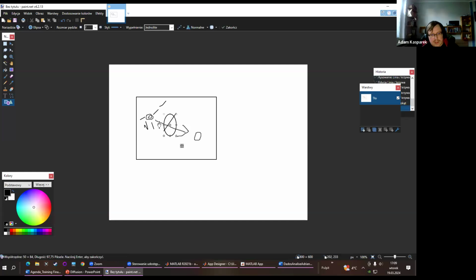There is some mountain which it has to go around, because the fitting algorithm is not exactly perfect. And if we set our bounds too small, the path it takes may go around these bounds. It's not exactly clear science.